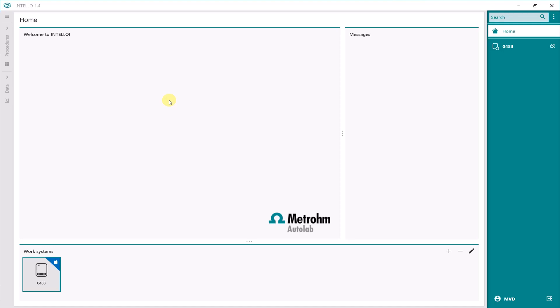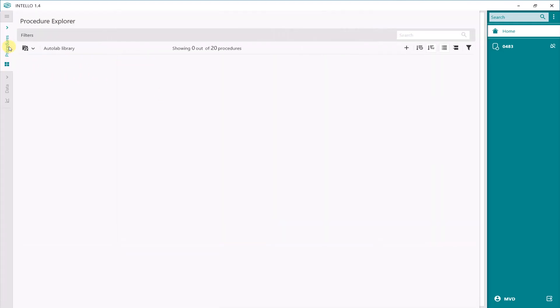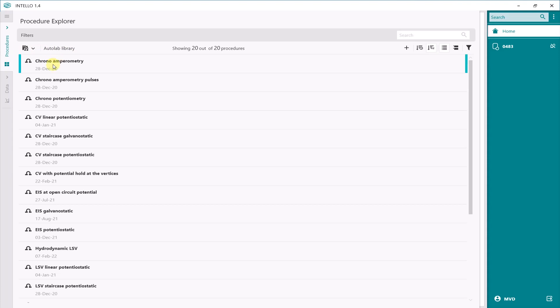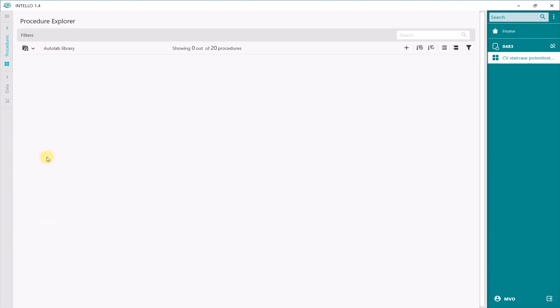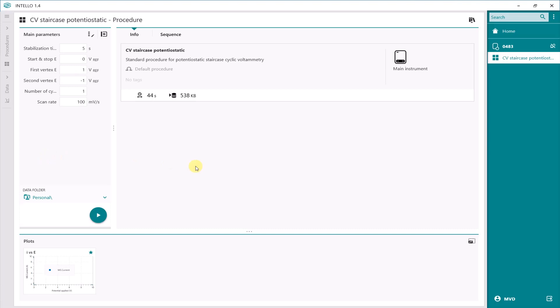We use the standard CVStaircase potentiostatic procedure from the Metrohm Autolab library and load it in our work system. In the procedures, under the Autolab library, you will find CVStaircase potentiostatic. Double click on it and it is loaded in the work system.